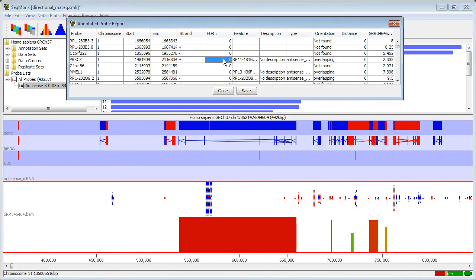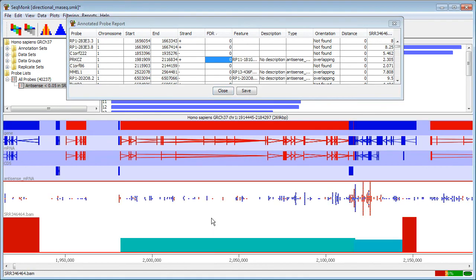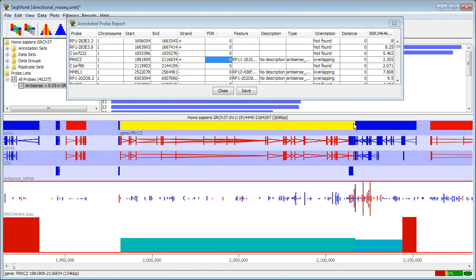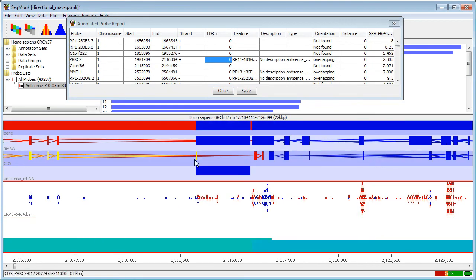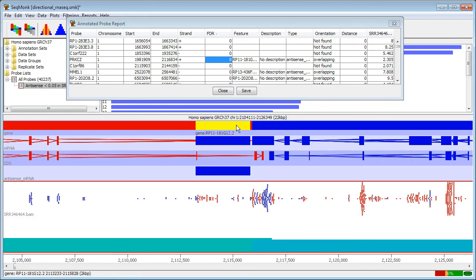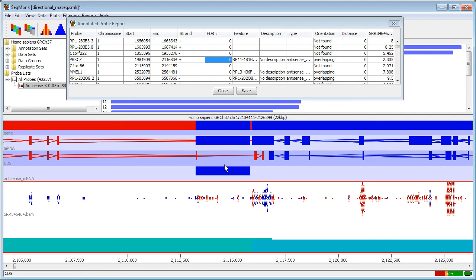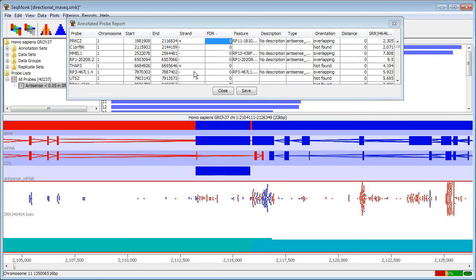And if I go down to some of the known antisense transcribing regions, here I have a part of my genome where I have two genes in opposing directions sitting over each other, so again it's not unexpected that there's antisense transcription down here.